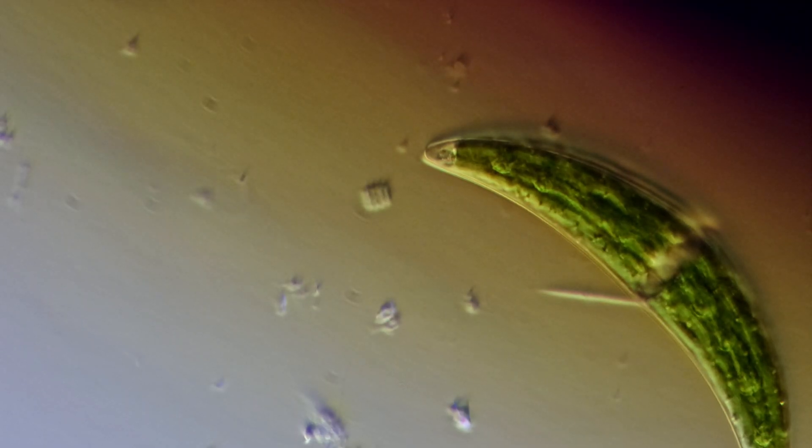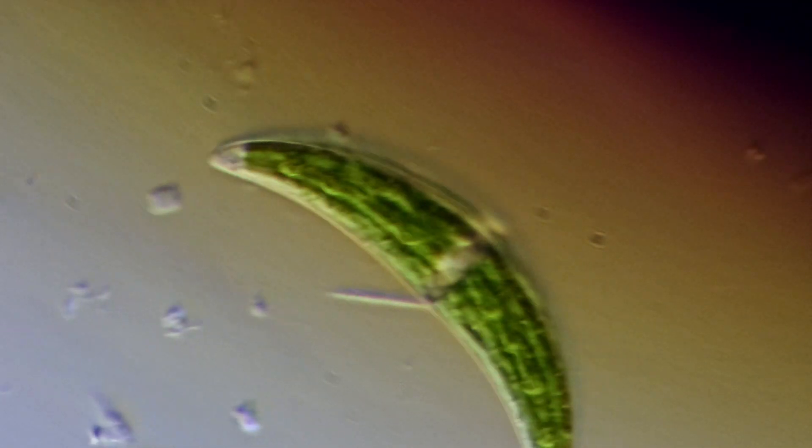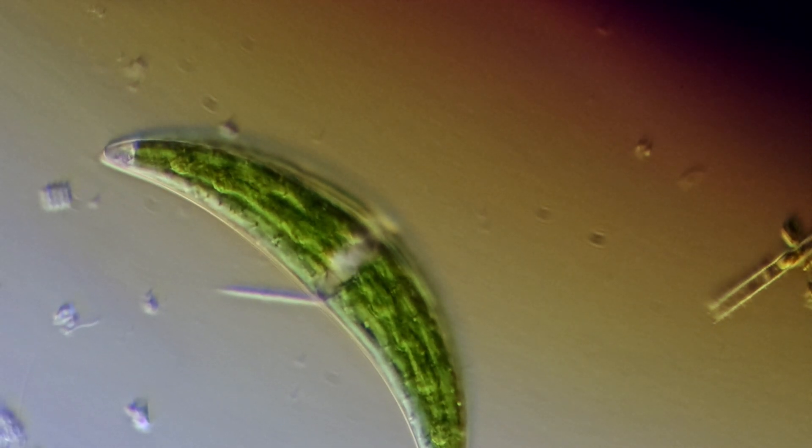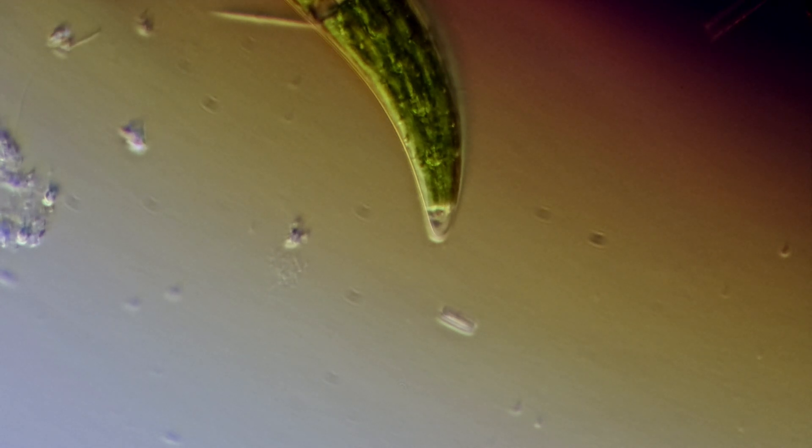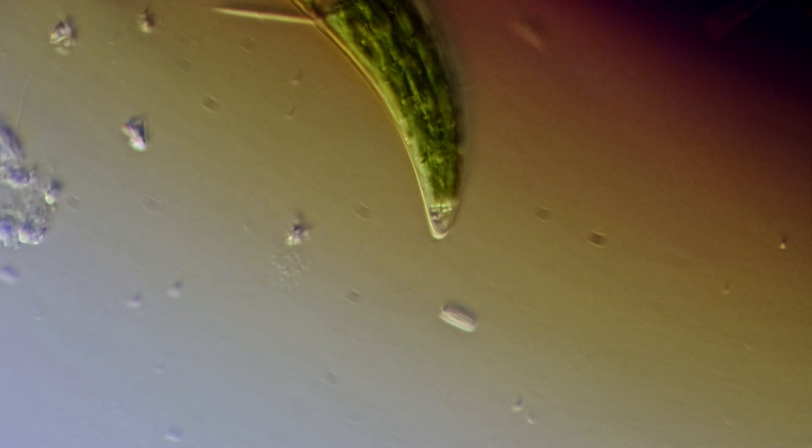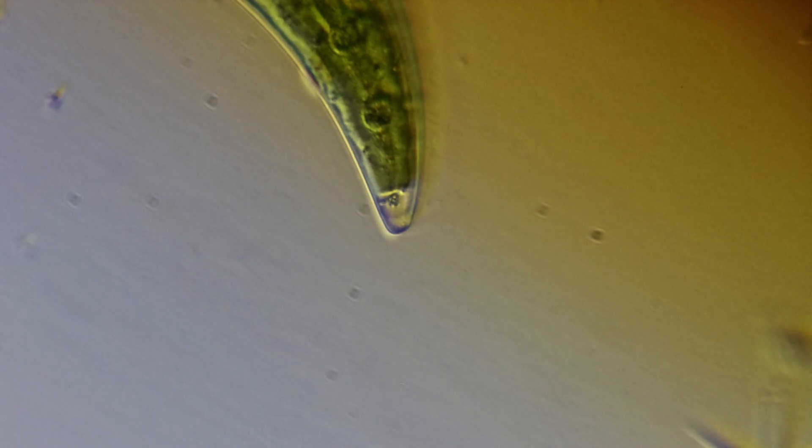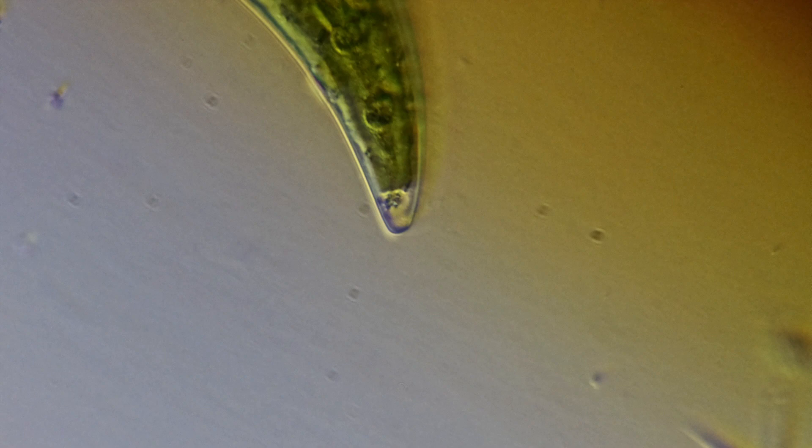Illuminated from the side we begin to see some of the dimensions within Closterium. I think that's important. Microscopes have a way of making us feel like the microscopic world is two-dimensional because we are fundamentally restricted to looking straight down at it. I've been looking for ways to fill it out, show it is more full. I don't have the budget for expensive microscopes, so I work with rearranging light.